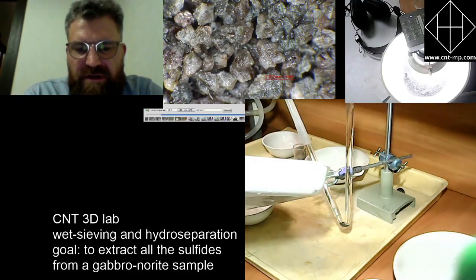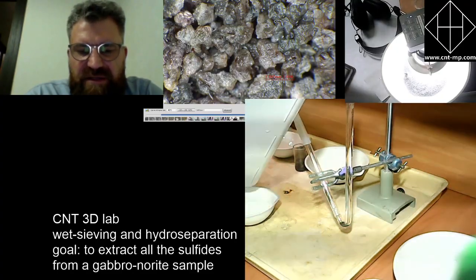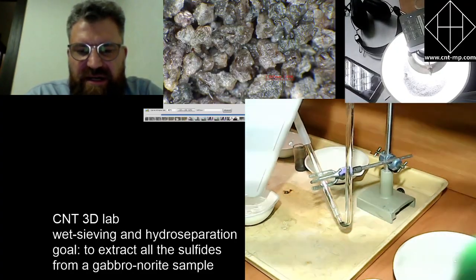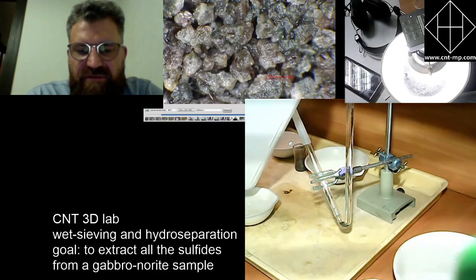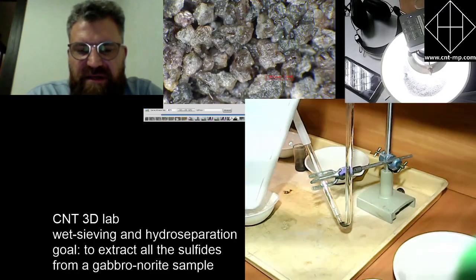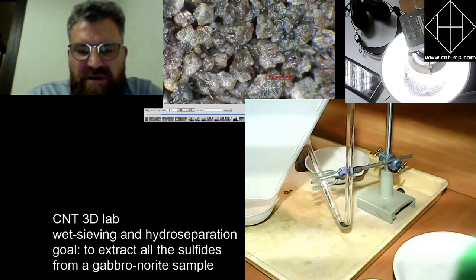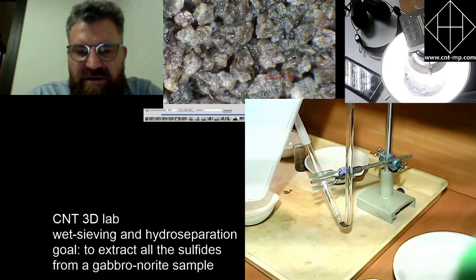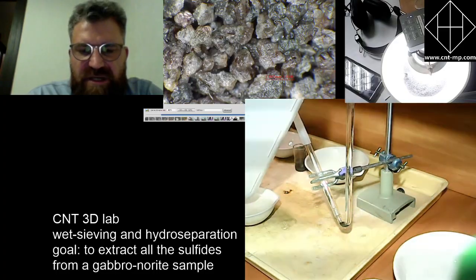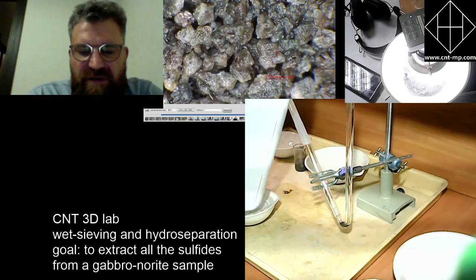So you can see the trays, one bigger tray and another one inside the bigger tray. Again, the point is not to lose a grain for any reason, by spilling, by changing vessels. It's all collected eventually in one vessel, so any grain can be collected and not lost. So that's why we have such a minimal weight loss of the final product.